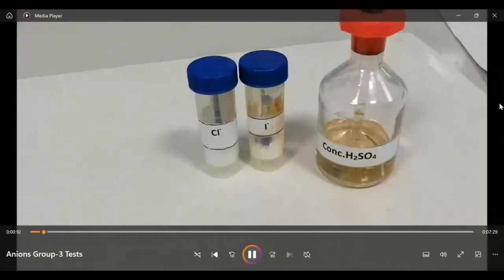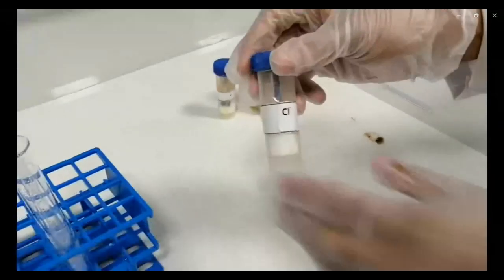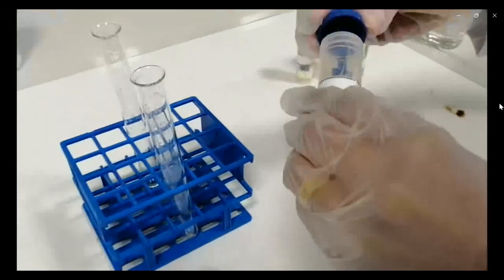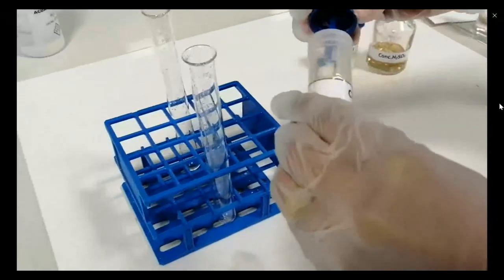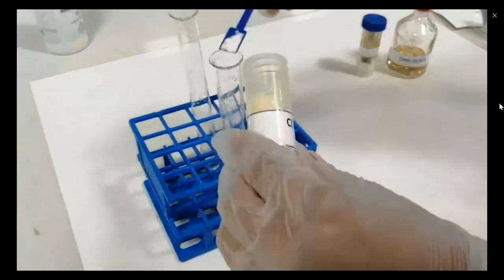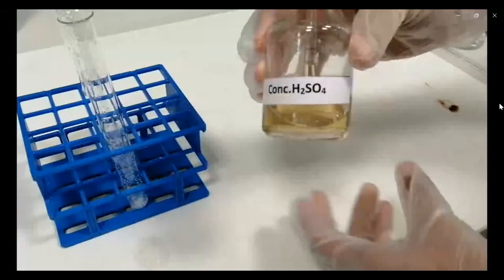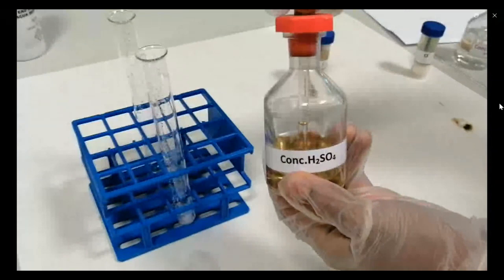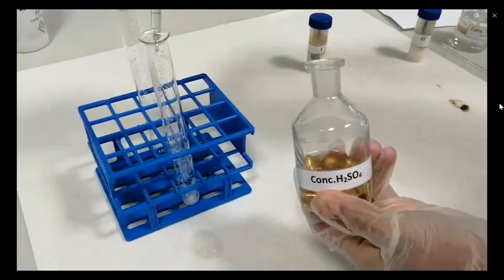First we are going to do the primary test, which you have to do on the salt. Just a few crystals, and then add the group reagent directly to the salt. In a dry and clean test tube, just add Conc sulfuric acid reagent, and we use droppers for the acids. It's very dangerous.